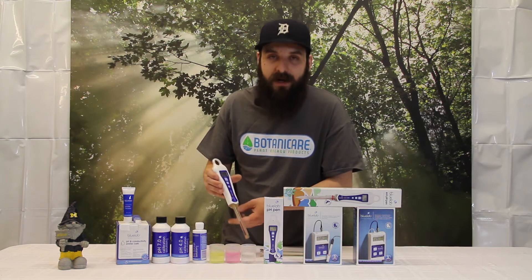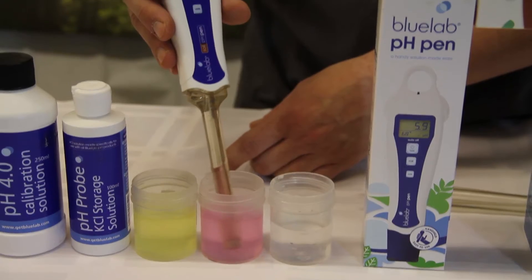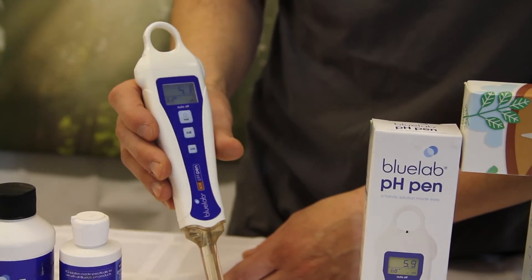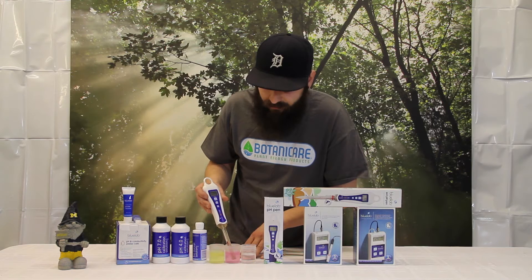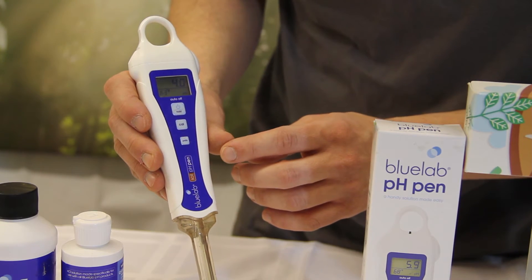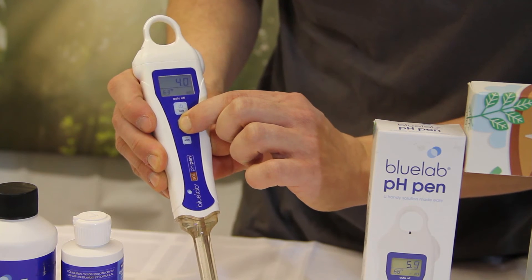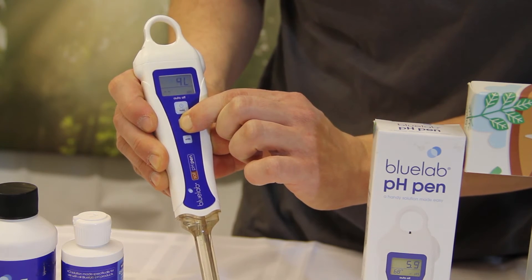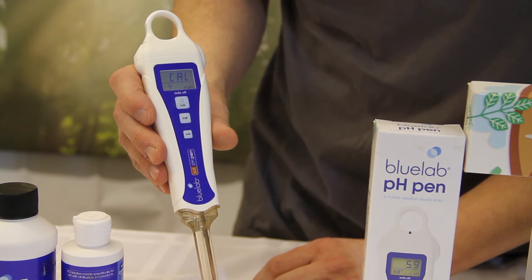Then we'll go ahead and repeat the process in the 4.0 solution. Stick it in the 4.0 solution, give it a little swish and wait for it to stabilize. Once again, don't get anxious and press the button too early or you won't get a good calibration. Once it's stopped moving around, same thing — go ahead and press and hold CAL. It's going to read CAL and then give it an extra couple of seconds and it'll read 4.0.